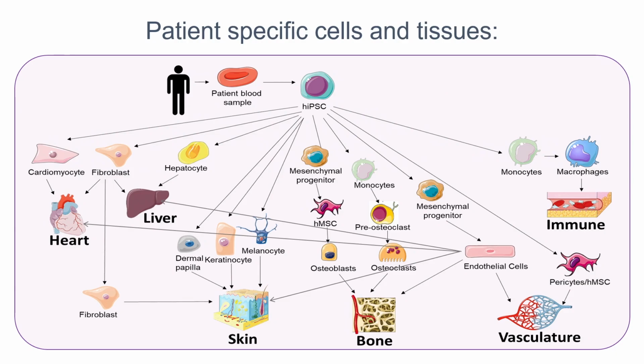So then you can make these physiological units, sometimes just a single tissue, multiple cell types, they're always multicellular, sometimes multiple tissues linked to each other by vascular perfusion or possibly innervation that are all isogenic, they're all genetically clean.